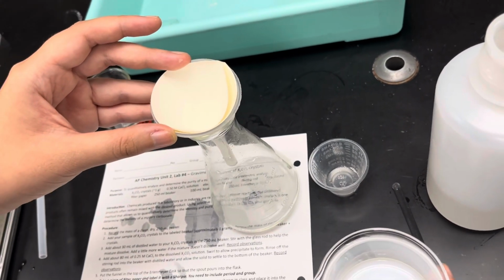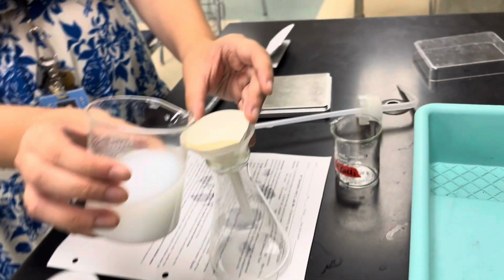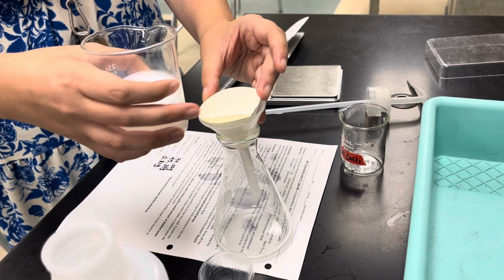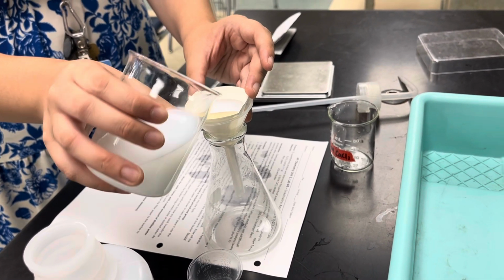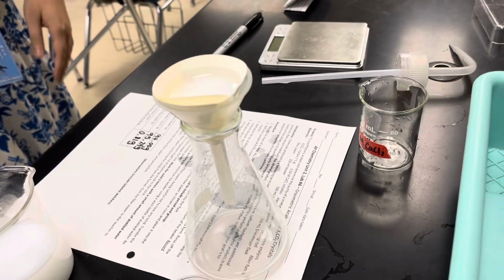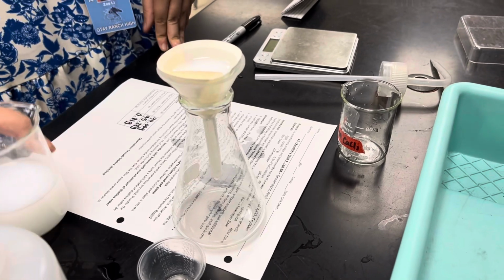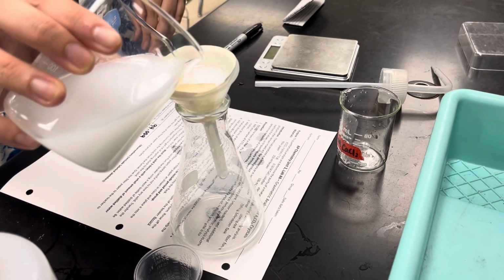Now we're going to pour all of the solution into the funnel. So you should be expecting the bottom to be colorless and the top to catch all of the white chalk that we made. So we're gonna go ahead and pour it. And you can see it's gonna take a very long time for it to filter because it needs to get rid of all of the precipitate on the top.